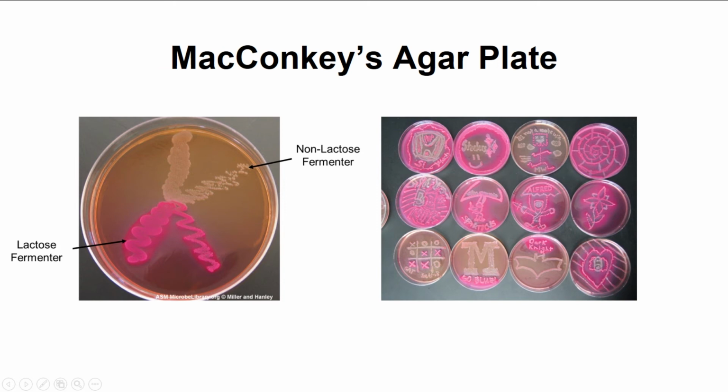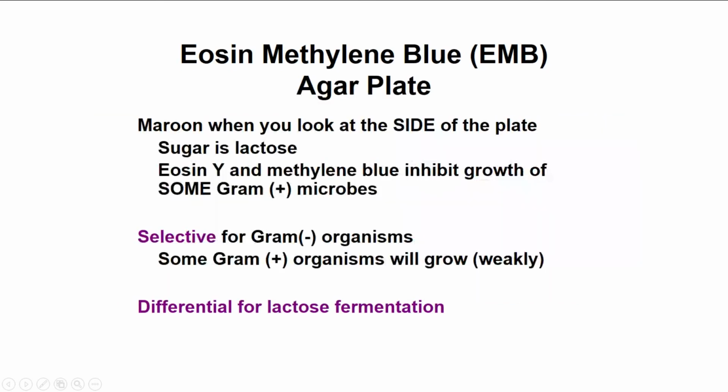But yeah, you should remember that. Strong lactose fermenter, pink colonies, pink halo. Weak lactose fermenters, just slight pink coloration. Non-lactose fermenters, tan, no coloration of the agar.